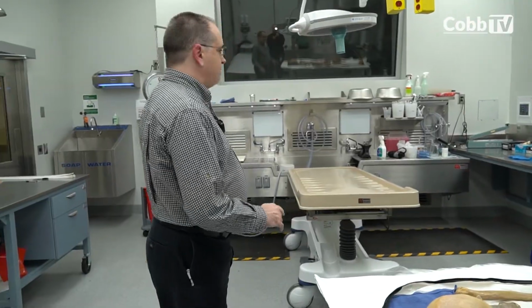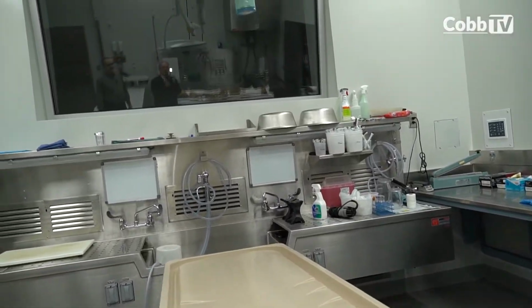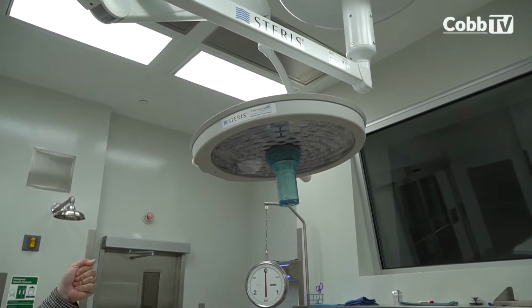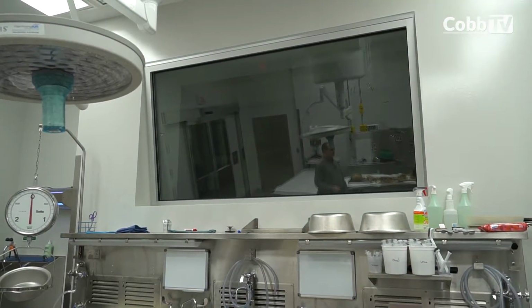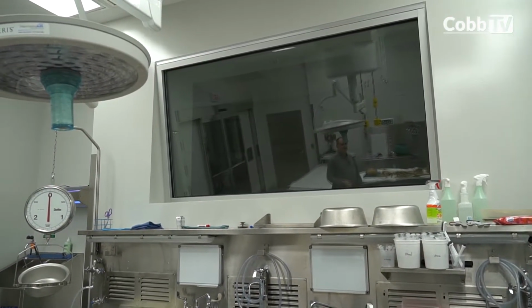As you can see, this is a single autopsy station and is used for, like I said, infectious cases. We do have the capability to broadcast to an observation deck for police officers who need to be present for their autopsy. We can keep them safe while we do it. This isn't a general education tool. It can be used for medical education, but we don't have a sign-up list for who gets to come watch an autopsy because that's not very respectful to the decedent. So we're back in the main autopsy suite.